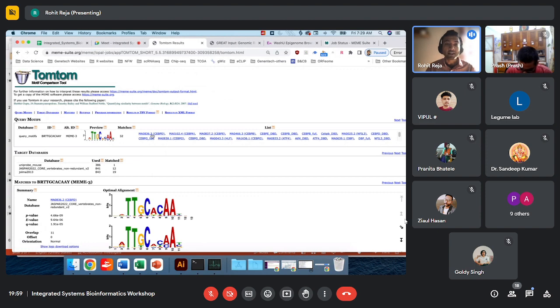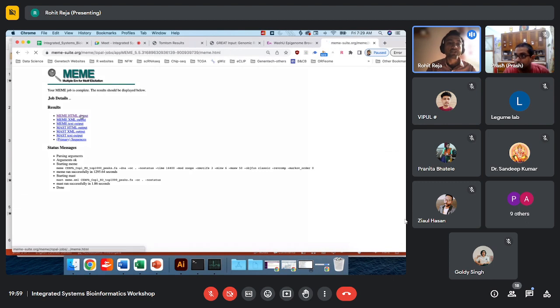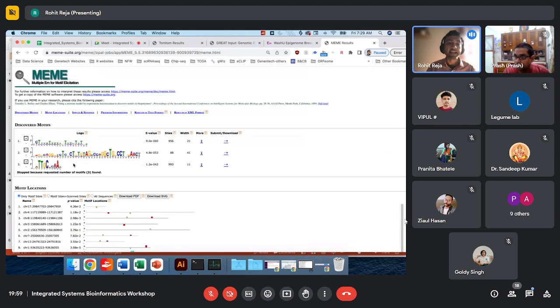And on top of that, other than top motifs, from your motif analysis you can also get other cofactors that are actually enriched with CEBP beta. So these are the top 3 motifs, but if you repeat this analysis with, let's say, more than 3, or 6 or 7 motifs, you can also get some of the cofactors that are enriched along with it in your peaks.